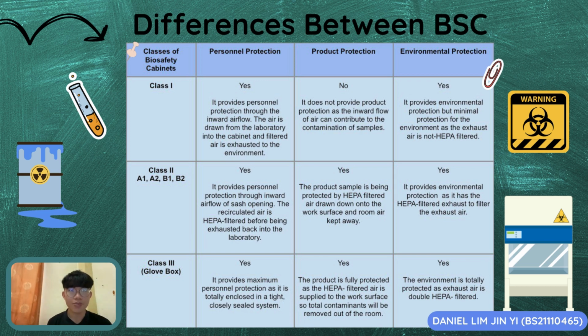Now I would like to explain the differences of Biological Safety Cabinet BSC classes on the aspects of personal protection, product protection, and environmental protection.